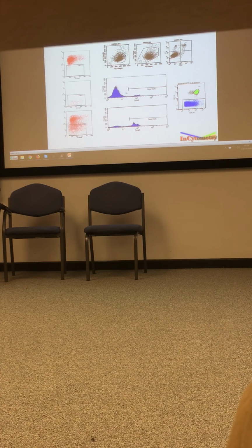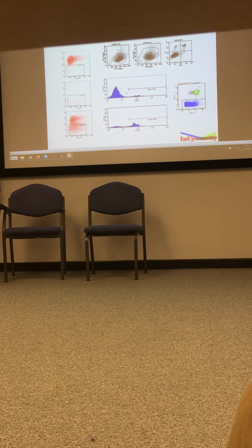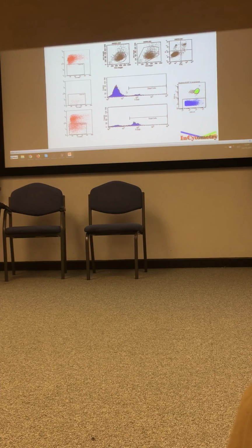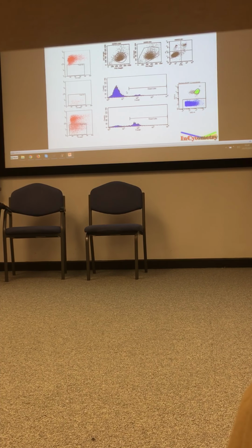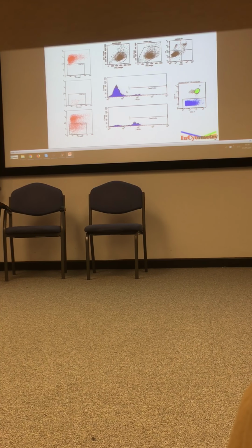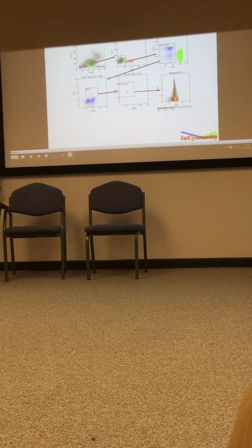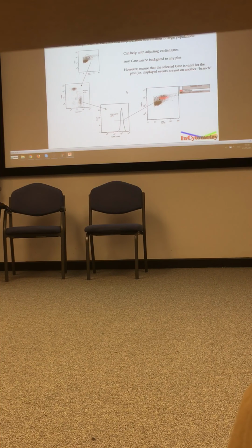You need to sort of play around with your data. And that is more or less a technical term for me: play around with your data. When you've acquired the data from your experiment, try things. Add gates, take gates away, move gates around, draw different plots, have a look, see what it looks like. That's the only way you will actually get to know your data and find populations you maybe didn't even know you had. I'm not going to go for sequential gating, that's too obvious.